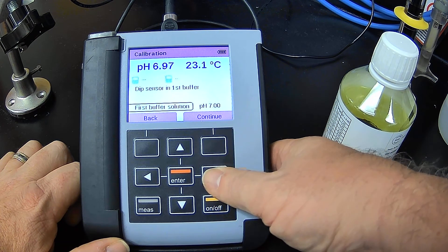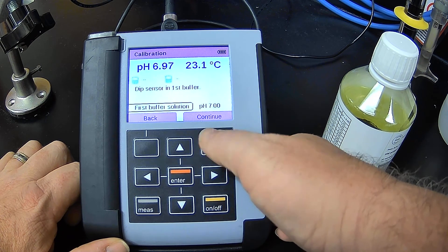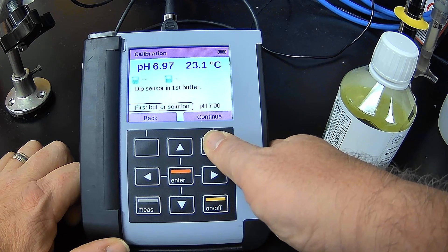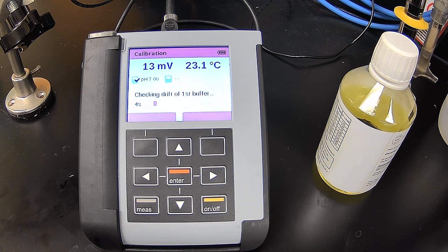If I were in a buffer 4 at this moment, I could come over and change it. But of course, I'm not. I'm in a buffer 7. I hit enter. Continue. While that's doing that, I'm going to open up the buffer 4 so I can do my second point of calibration.